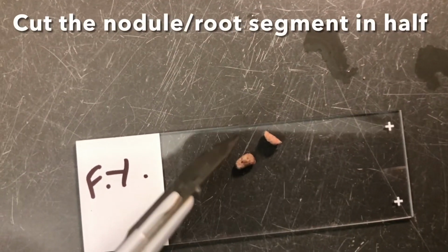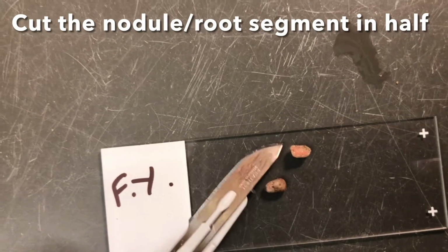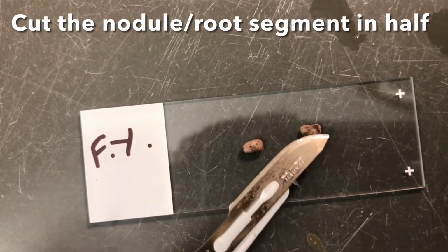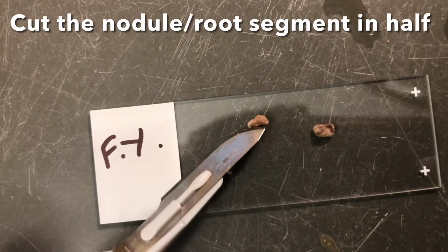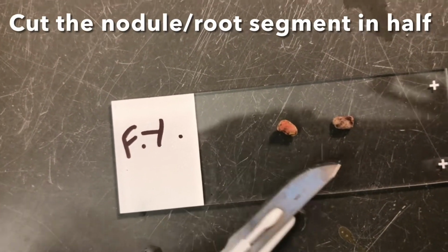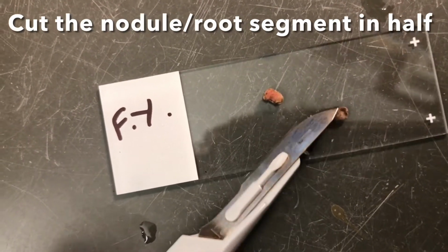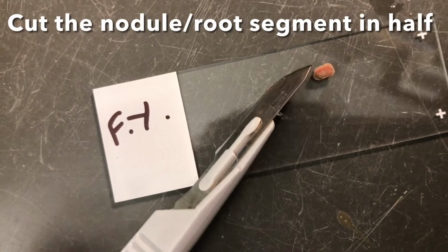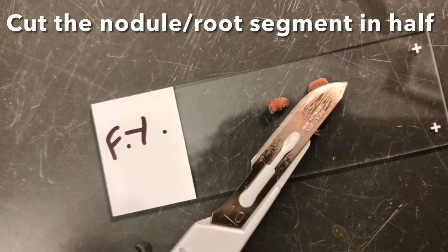So here's a nodule that I cut from the front yard, and sometimes it's hard to tell if a nodule is pink or not, but one way you can tell is when you cut it in half. If it's big enough, you will be able to see a pinkish color inside. And we actually see that here, pinkish color inside.